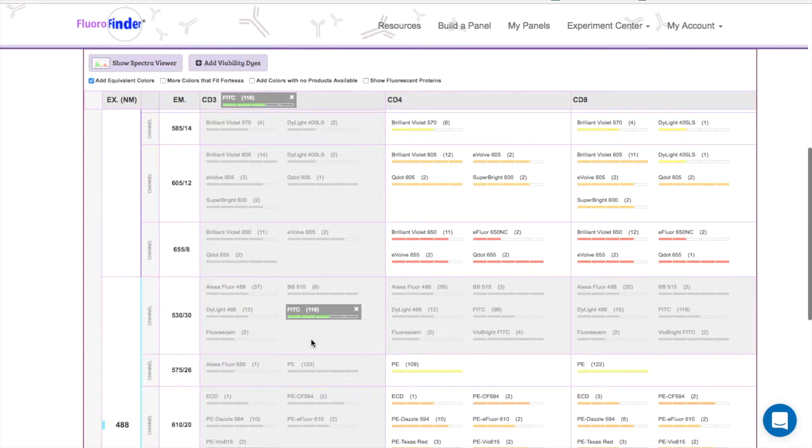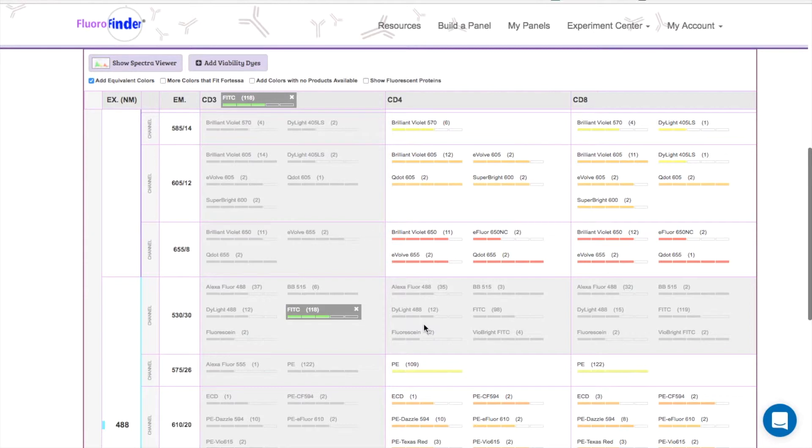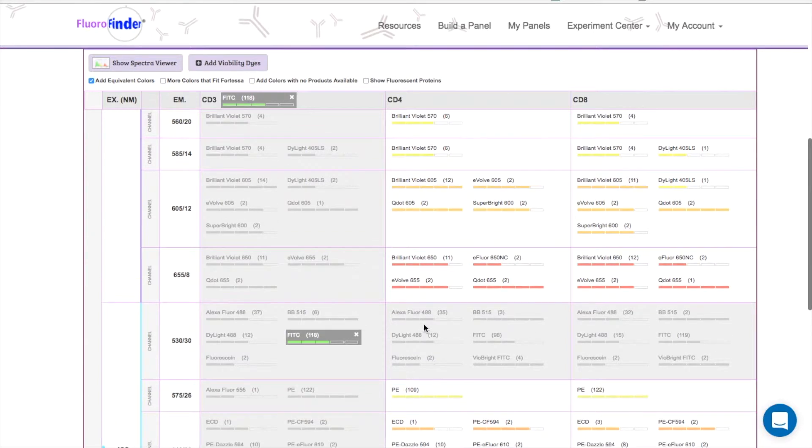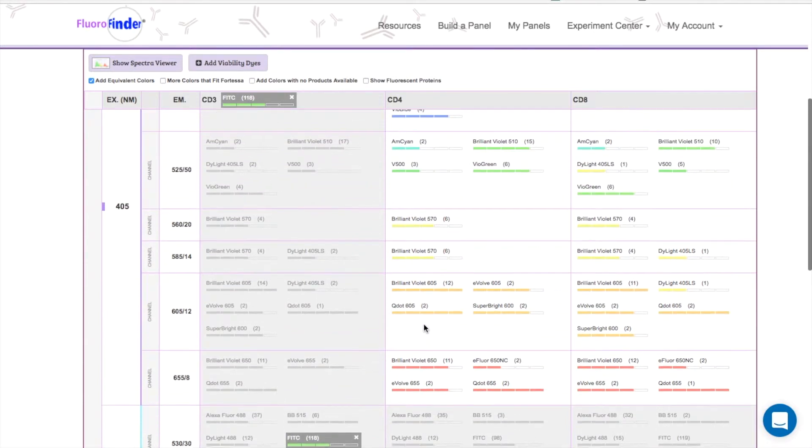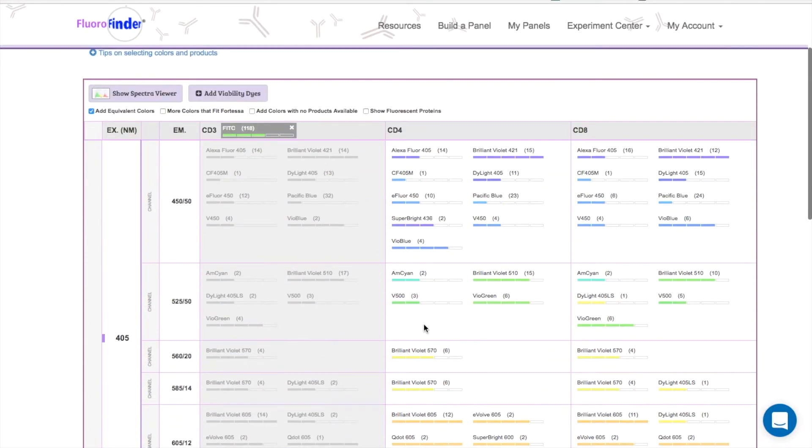You'll see that Fluorofinder has done something nice for us. First, it has blocked out all of the products for this channel. If you're new to Flow, you might not be aware that FITC and Alexa Fluor 488 are very similar. This feature prevents you from selecting equivalent colors that would be picked up by the same detector.